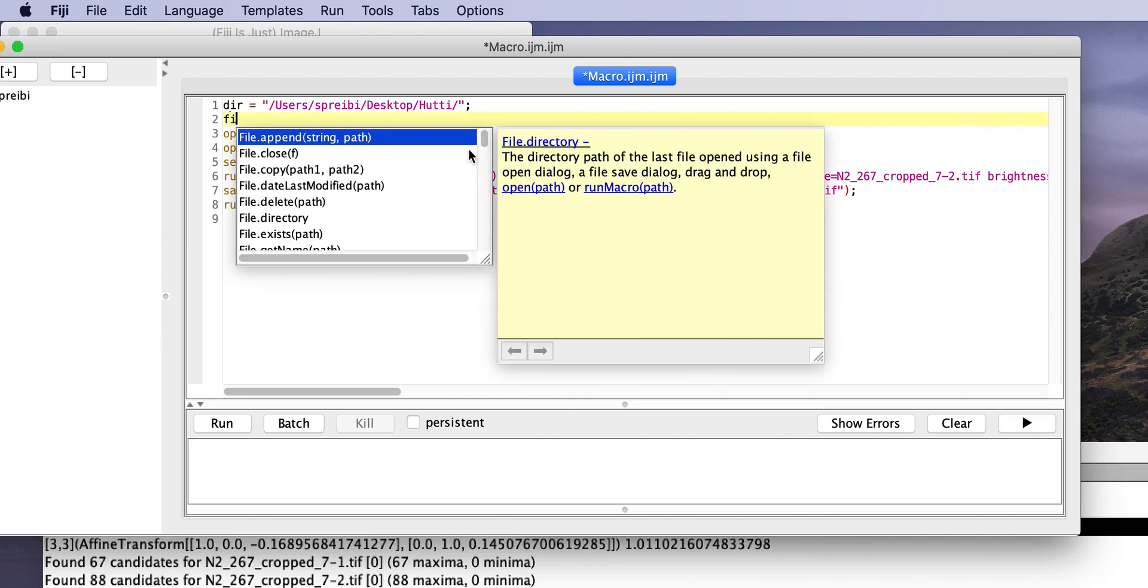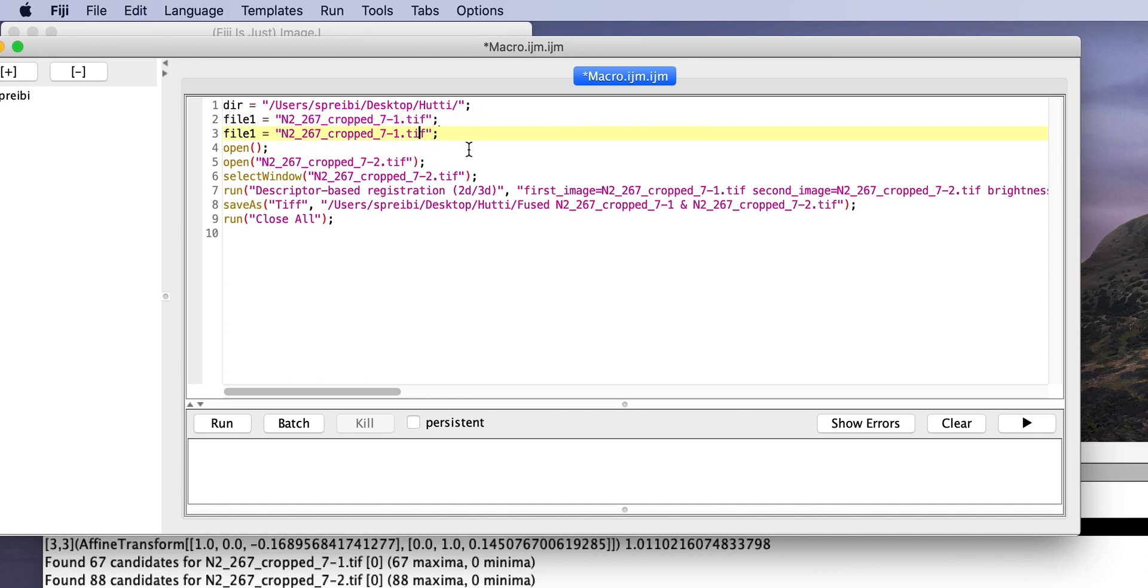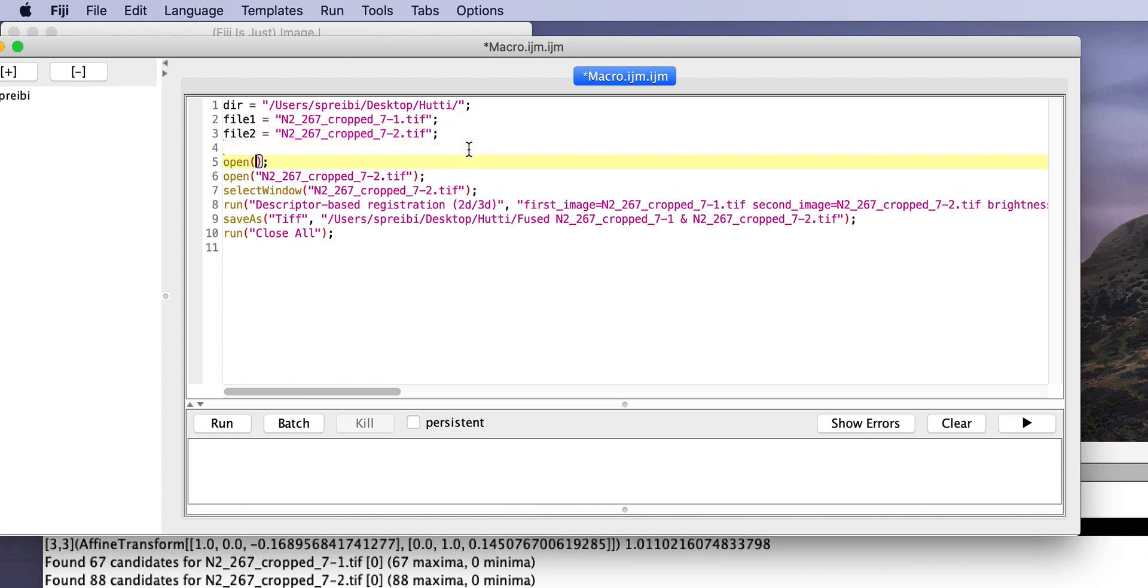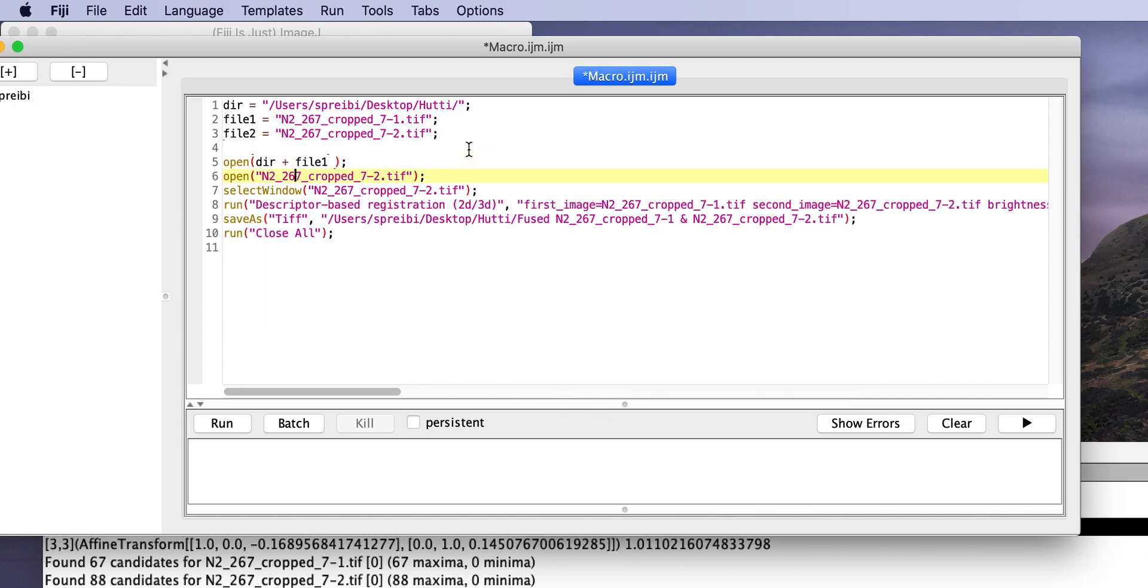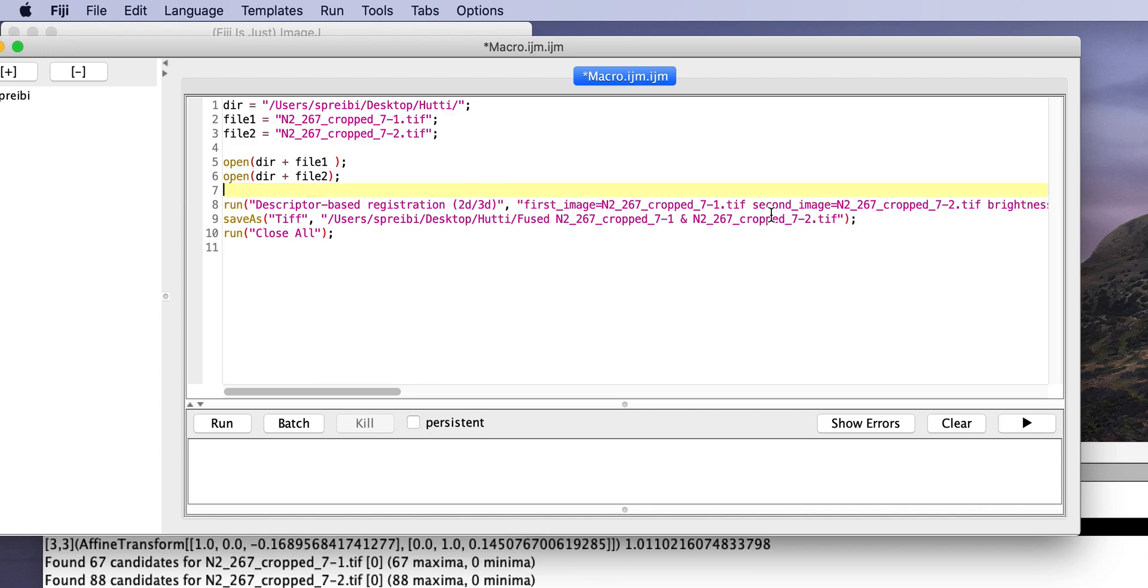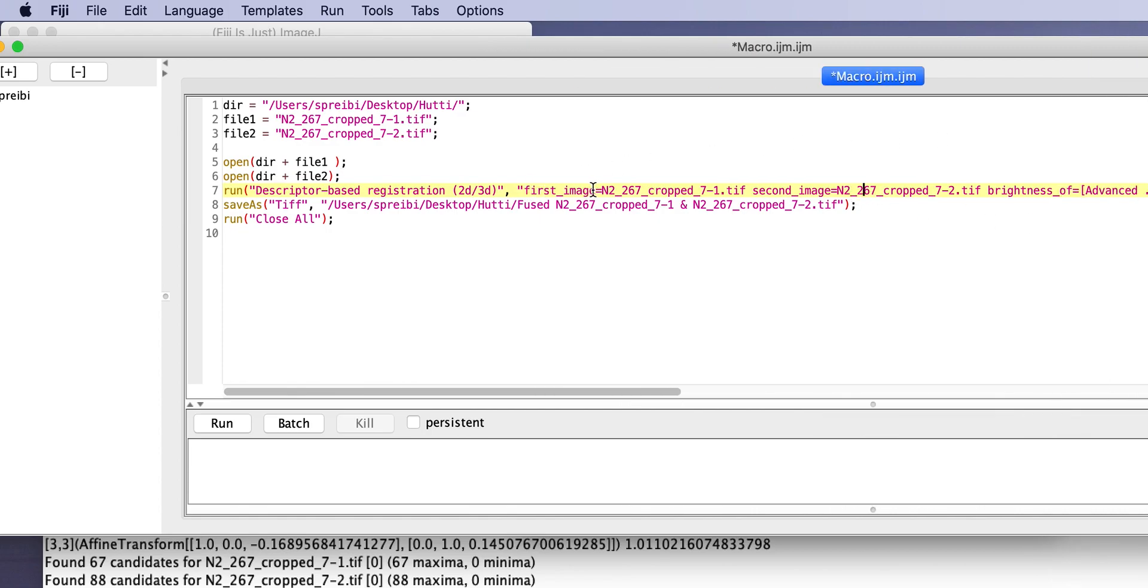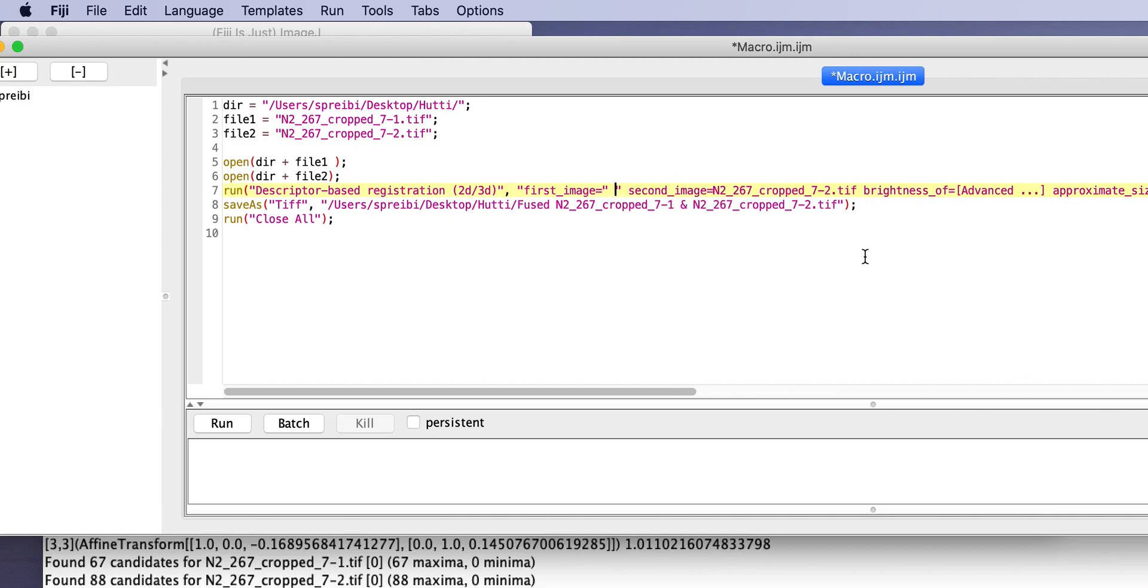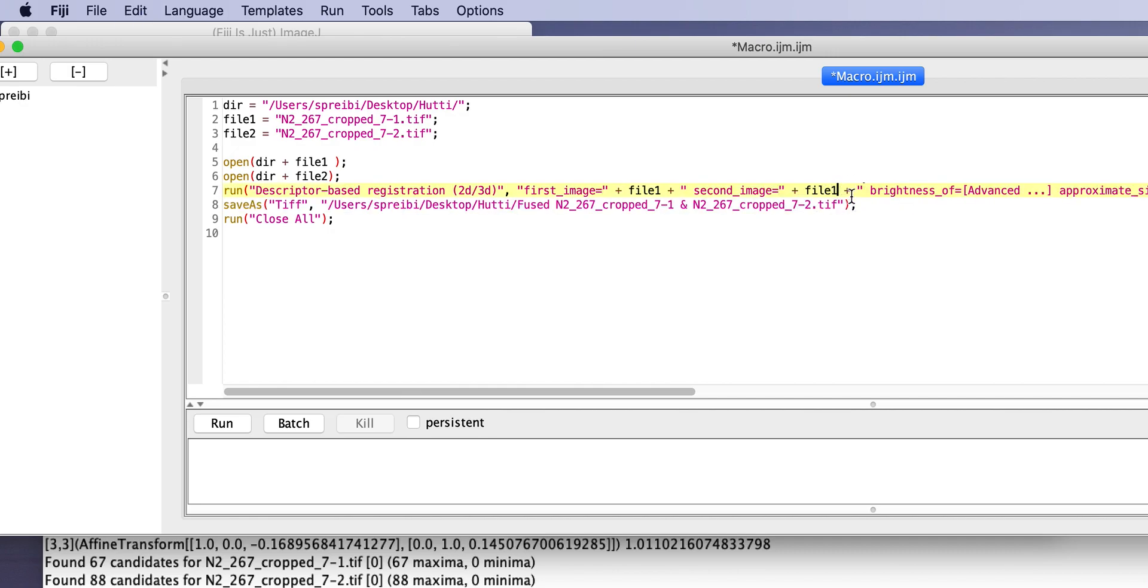So, we have file one is then this one. File two is this one. And now we open dir plus file one. We open dir plus file two. We don't have to select a window. So, now we have to look in here where the file name is here. First image is this. So, we replace this with file one. And the second image is here. And we replace this with file two. And we save as tiff.